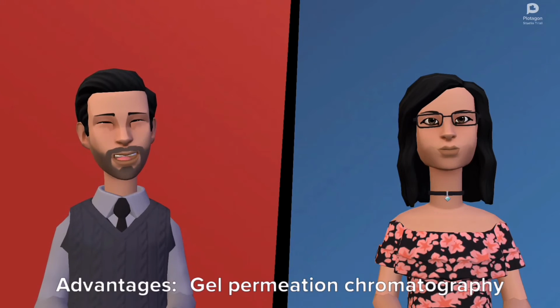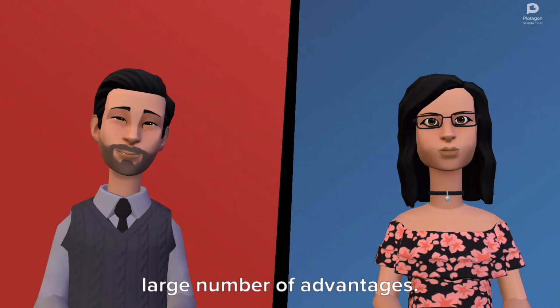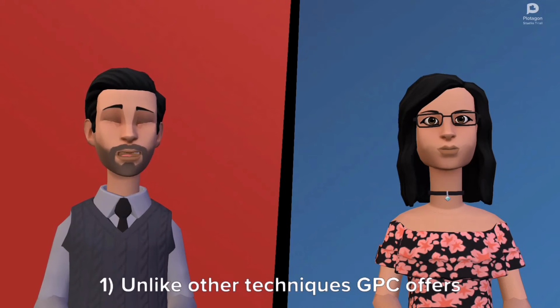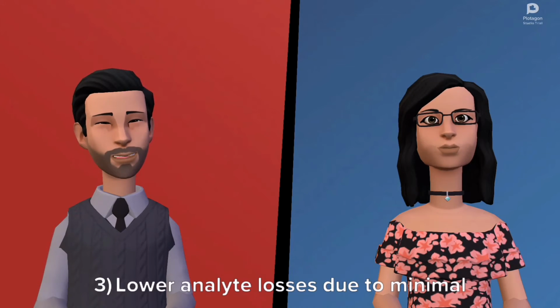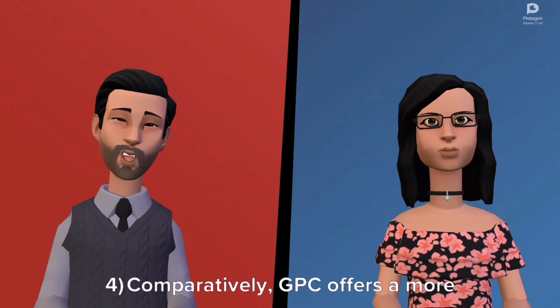Advantages. Gel permeation chromatography is widely adopted because it has a large number of advantages. Some of them are discussed below. 1. Unlike other techniques, GPC offers well-defined separation time. 2. GPC is quite famous for its narrow bands. 3. Lower analyte losses due to minimal chemical or physical interaction with the column.